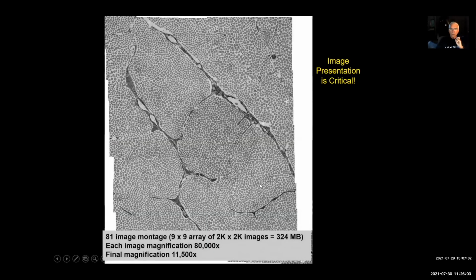If we look at tendon then, one of the things that we're very interested in doing, and this is sort of a method that we've developed over time, but it's more software oriented than it is anything else. But here I'll point out, first of all, that all these fibrils are cut in cross sections. So we have managed to maintain the linearity of the tendon. It did not roll up during preparation.